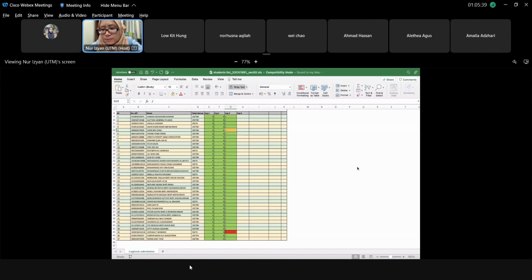Maybe I can pass to Dr. Amy. For the graph, you have to do it using Excel. You can use it directly from Excel, and you can also try to draw it manually if you want, but the y = mx + c and R square need to be obtained from the Excel anyway. It is much easier to use Excel to plot the graph.